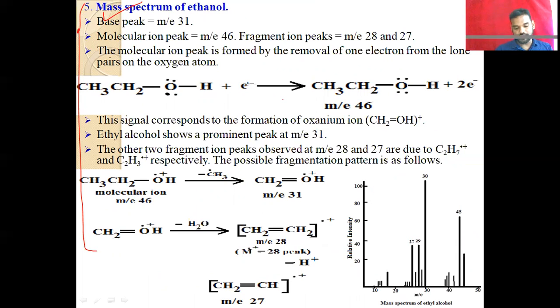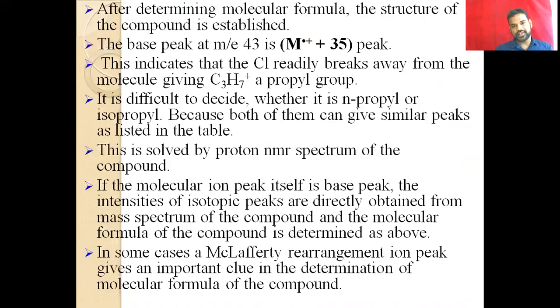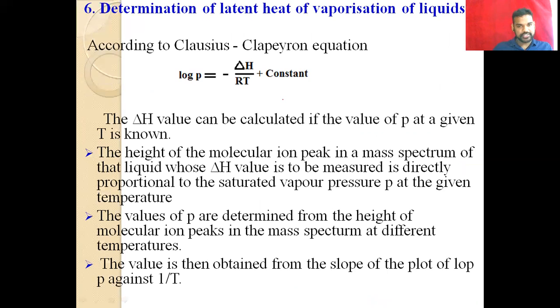And then we have the mass spectrum of ethanol. This is homework for you: you have to solve the mass spectrum of ethanol. In the next class I will go through the application of mass spectrum.